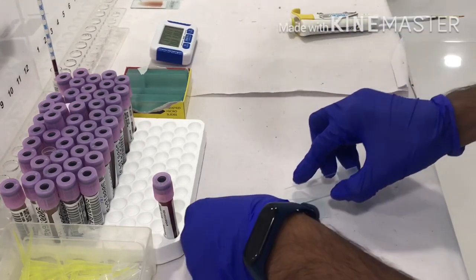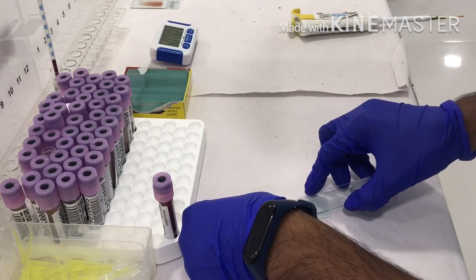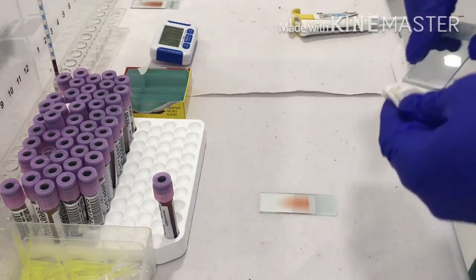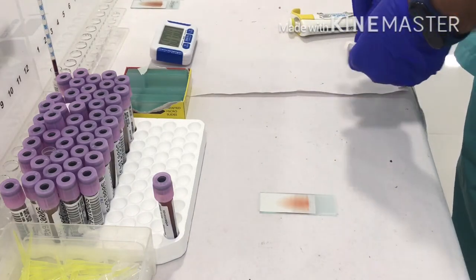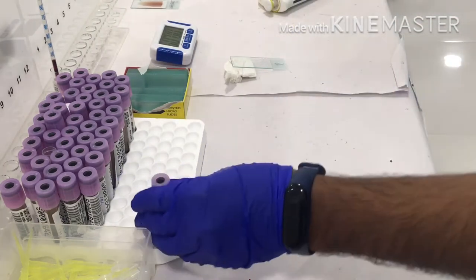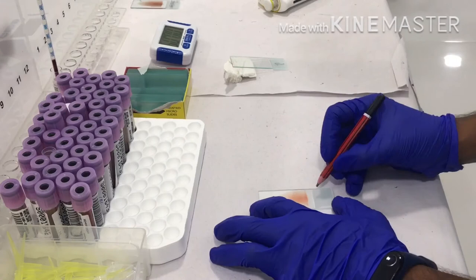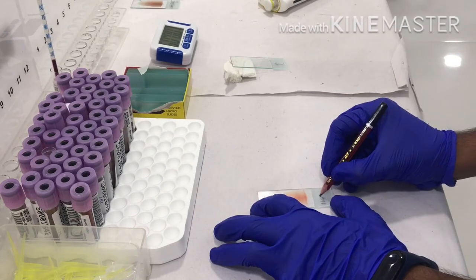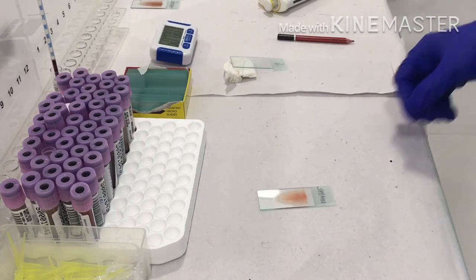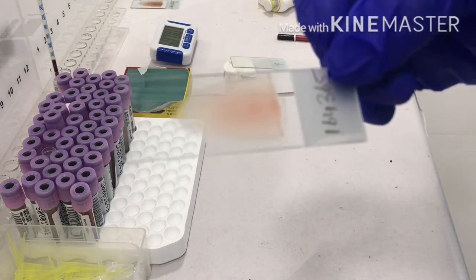This Leishman staining procedure is so easy nowadays. We are getting these things ready-made. Previous time we had to mix the methylene blue and eosin, all those things. Nowadays we get it prepared. Always we have to make sure that we are staining a smear which has been air dried. We have to keep this for air drying.